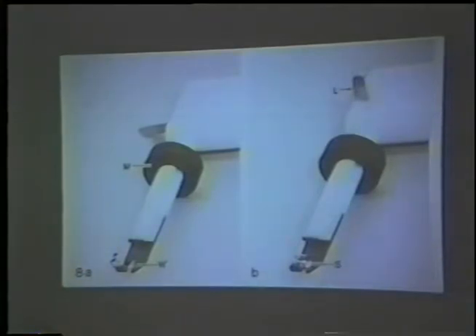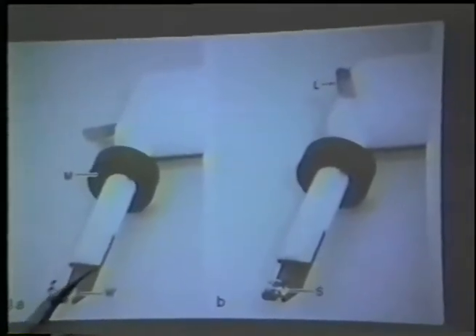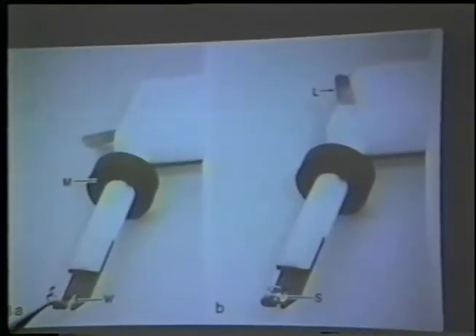Next, there we go. This is the sample holder, close up. There is a plastic sample. This is the actual sample holder element out here. It's made of Vespel plastic. It was developed for NASA and the space program many years ago. It maintains mechanical strength at very low and very high temperatures, and it turns out to be very suitable for this application. There's a well in the sample holder, and you build the sample directly in that well.